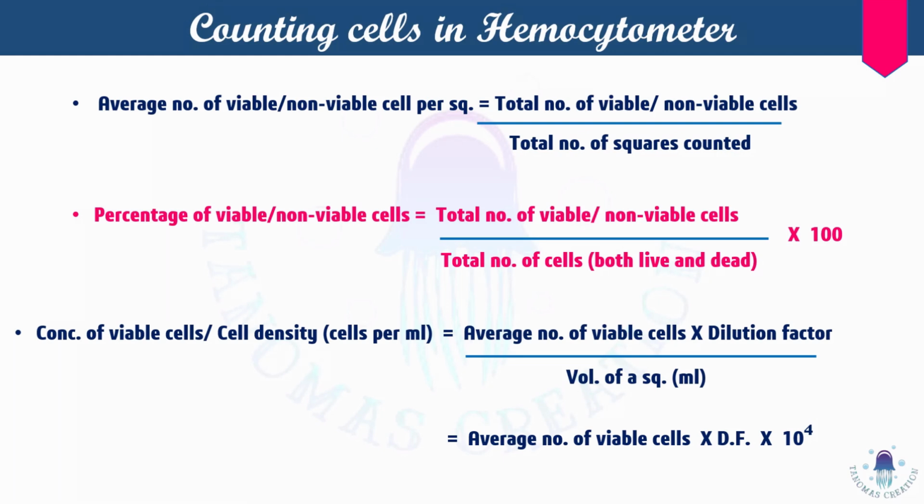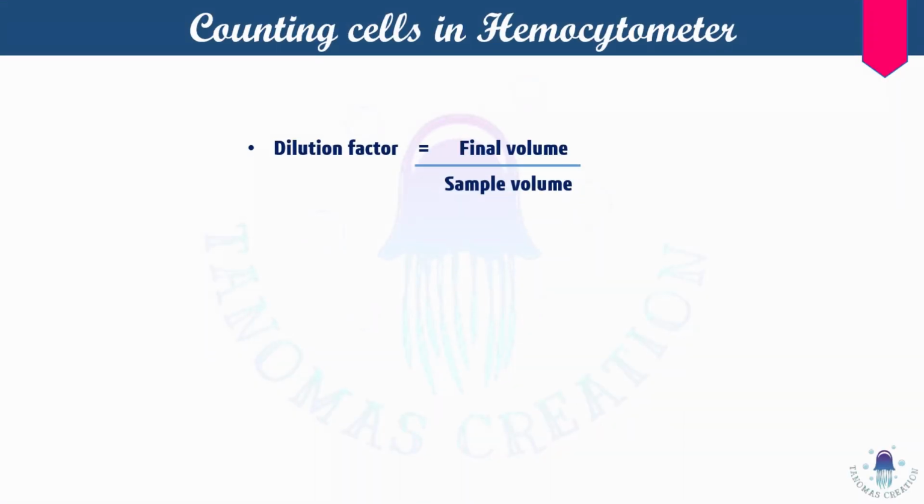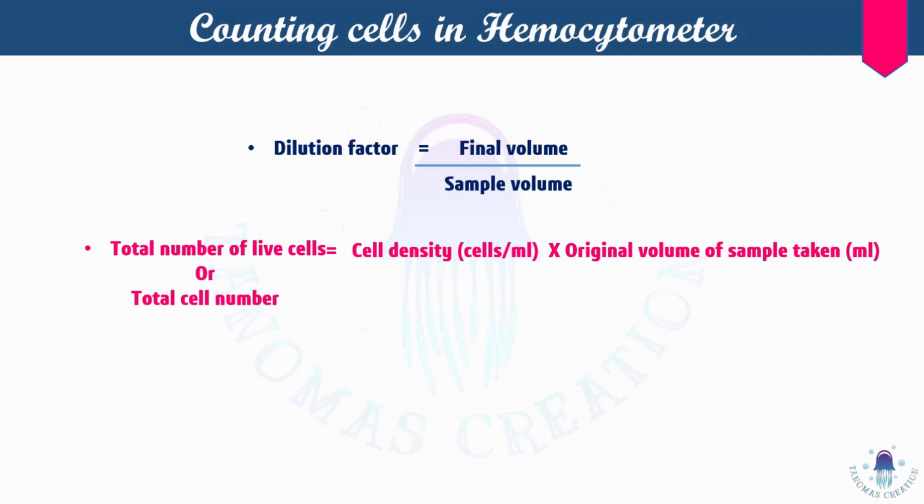Now coming to the dilution factor. To find the dilution factor, divide the final volume by the sample volume which we have taken. And if you want to find the total number of live cells in a certain amount of sample, we multiply the cell density which we got, cells per ml, by the original volume of sample taken in ml. We just multiply it and then we can get the total cell number present in our sample.